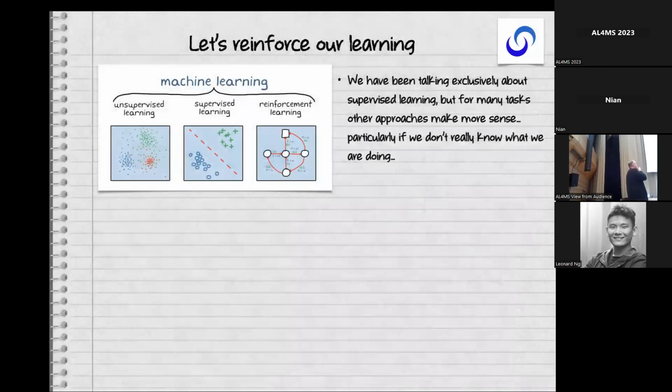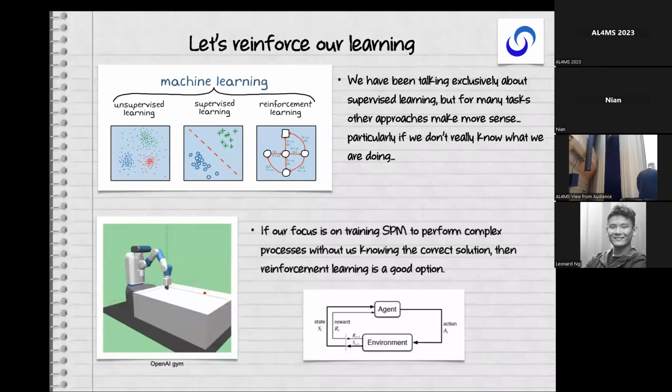We took that a little bit further and tried the idea of now autonomously doing something in AFM that is tedious to do for the experimentalists. And here we're going to move to reinforcement learning. I guess many people in here are very familiar with this idea, this branch of if you split machine learning into 3. So we have supervised learning, which is mostly what I've been talking about before, unsupervised learning, often classifying data. We've seen examples here. And reinforcement learning, which of course has become famous in the concept of robotics.